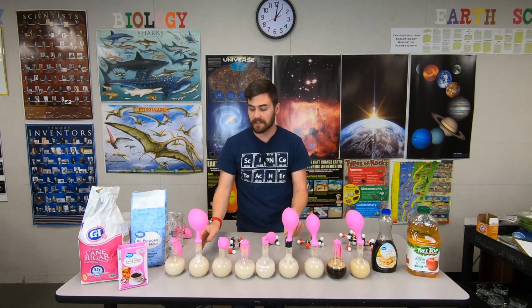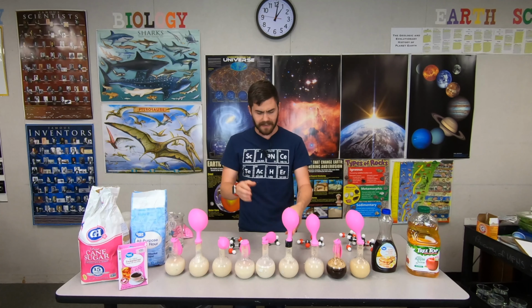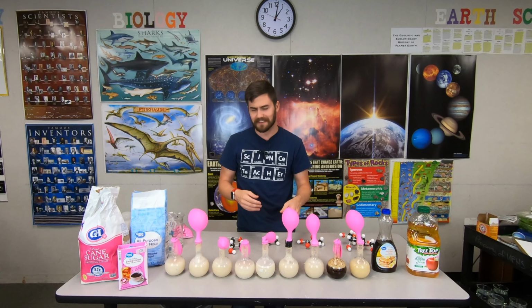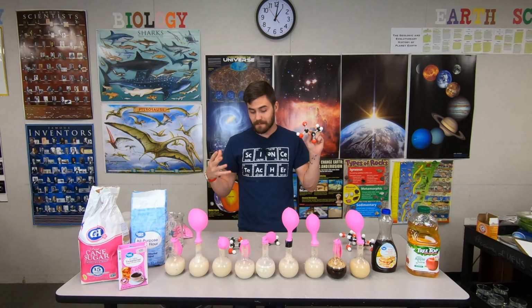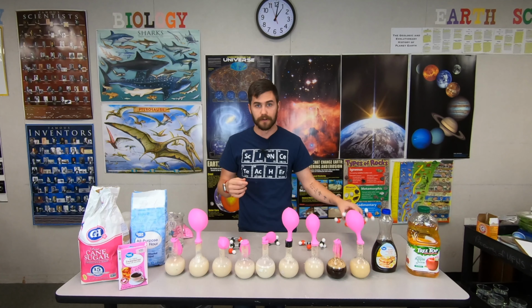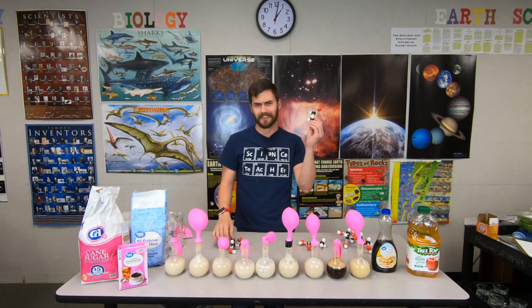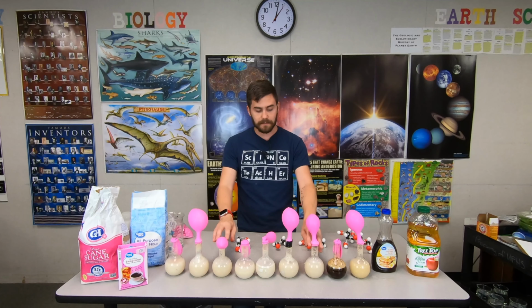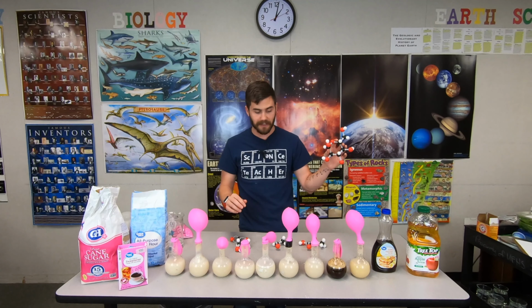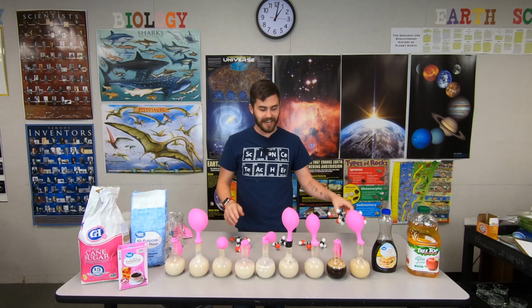These flasks quickly consumed all of the available food, converted the glucose and the starch, which I believe is what's in flour, into pyruvic acid. And then once they ran out of glucose or starch to break down, they started converting it into, what's this called? Acetaldehyde and ethanol and carbon dioxide. These flasks were behind because they still had glucose available to break down. That's my hypothesis, I should say.